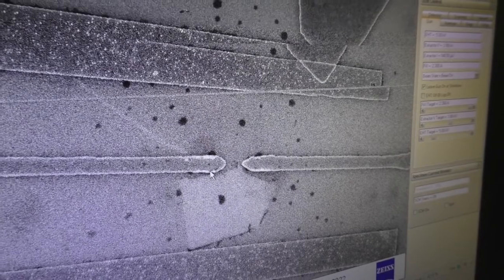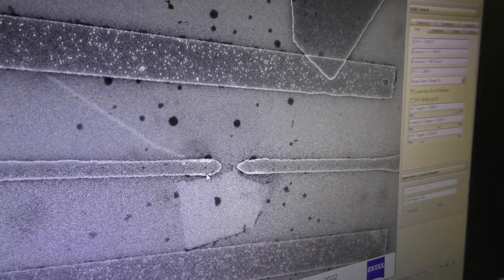On the other hand, if we scan a larger area, the corresponding magnification would be lower.